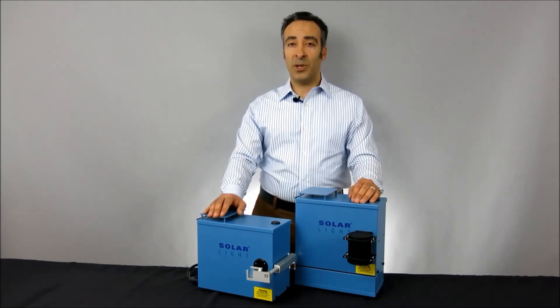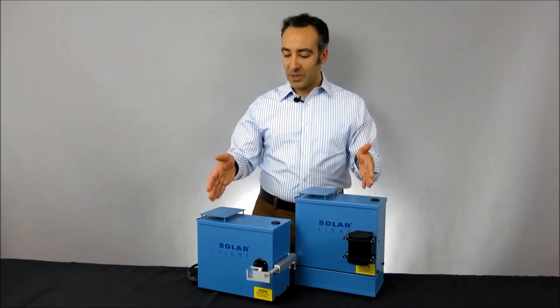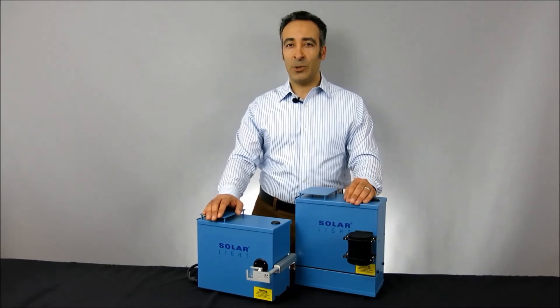Hi, I'm Osha Levy, Vice President of Marketing at Solar Light, and today we're going to be discussing our 16S-series solar simulators.